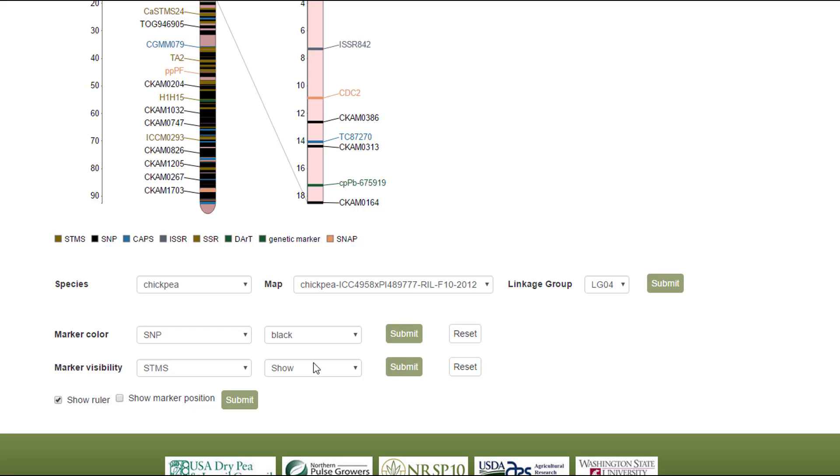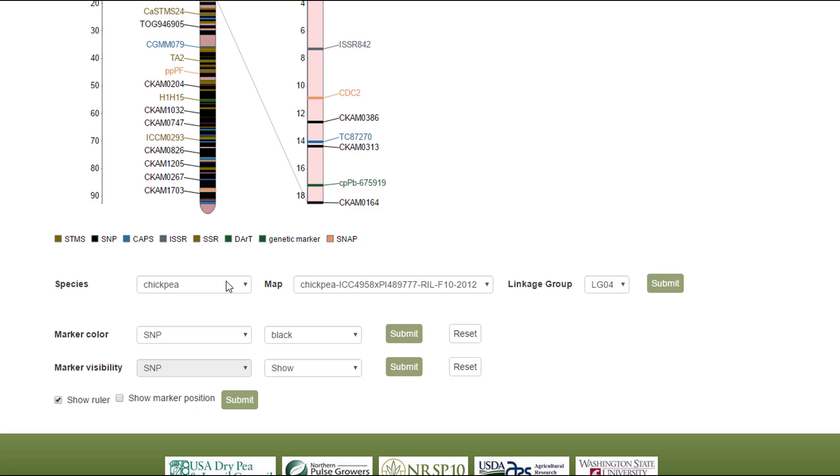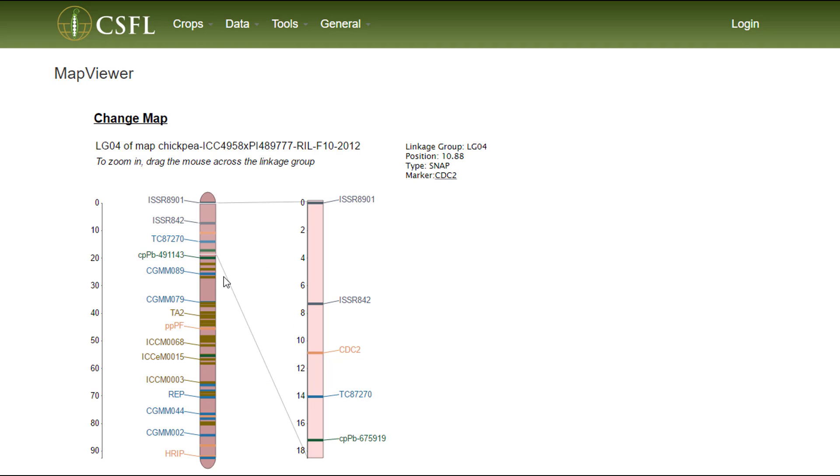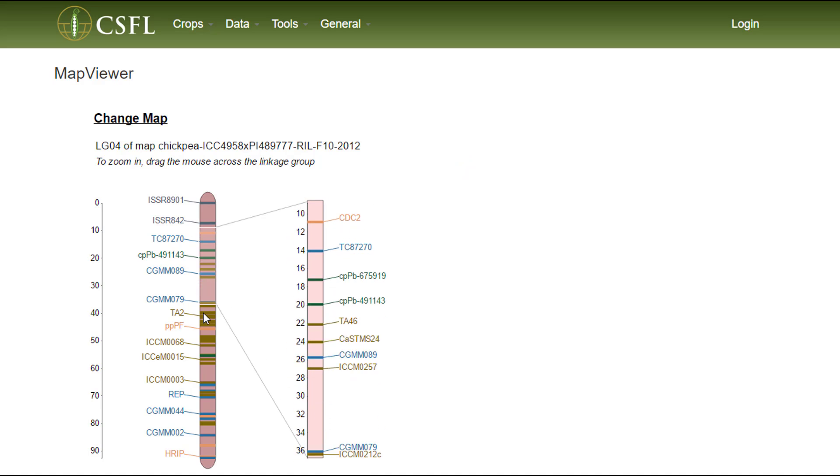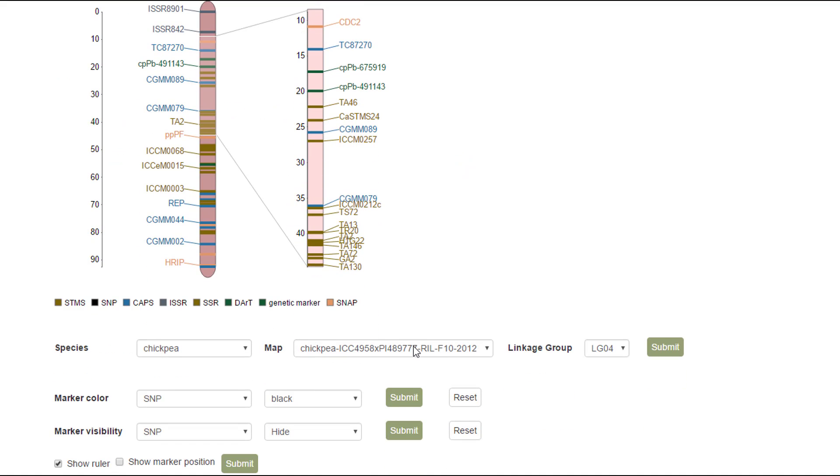We can also hide the SNP markers by selecting them under the Marker Visibility control panel and telling the program to hide them. Now we have a map without the SNP markers visible.